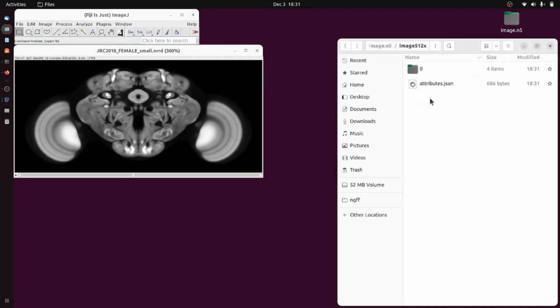this folder, we see that the first level of folders only has one folder inside of it. And that's because this level of folders describes the number of blocks needed to cover the X extent of the image. Now there is only one folder because blocks are wider than the X dimension of the image. 512 blocks compared to 505 in X for this image.